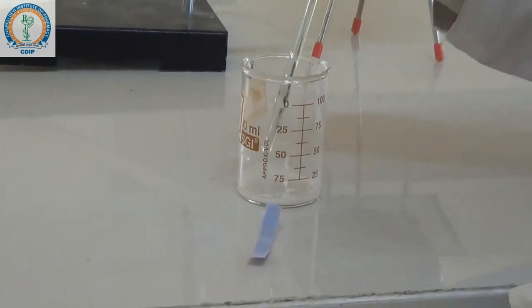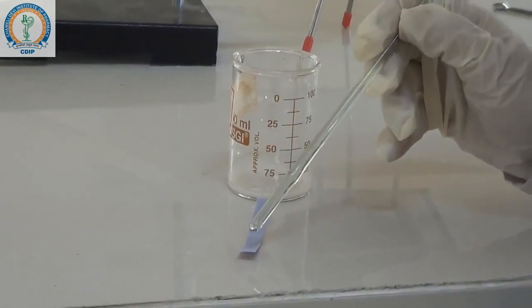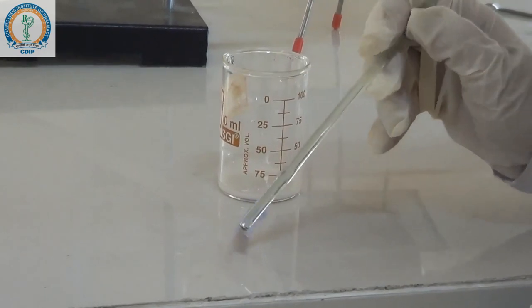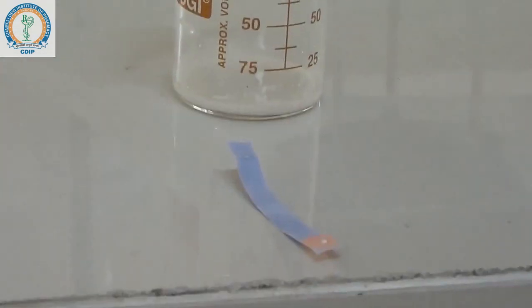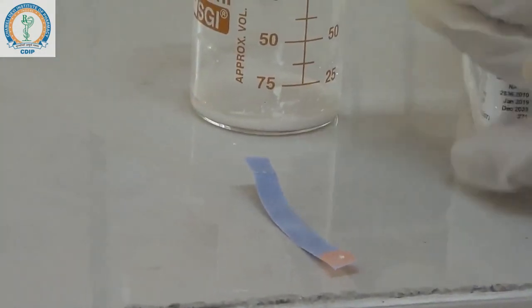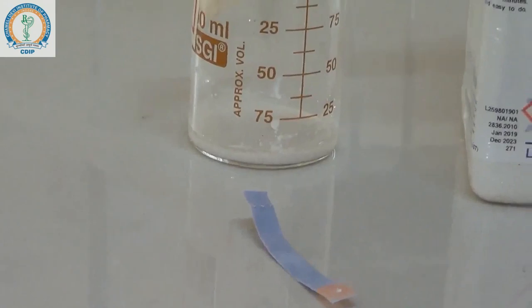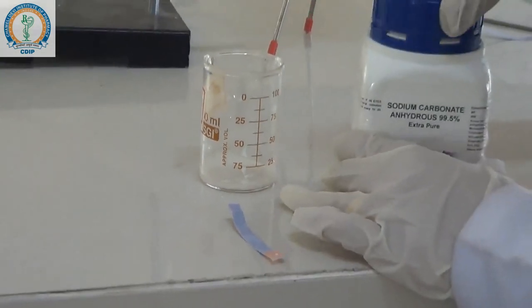Thereafter, we are going to check the pH of the reaction mixture. As we can see, it is acidic, so we need to neutralize it with the help of powdered sodium carbonate.